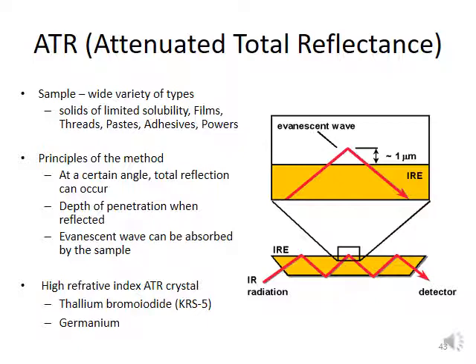So in this case, the crystal that they use is a high refractive index ATR crystal. Basically, it's made from thallium bromoiodide, and also germanium.